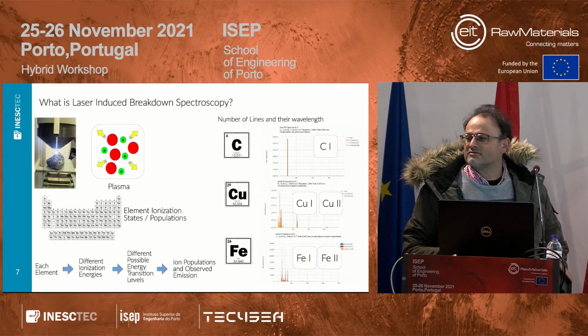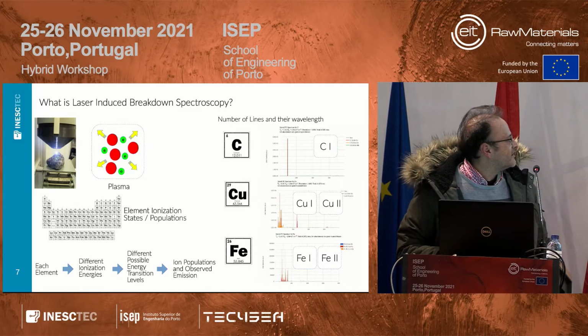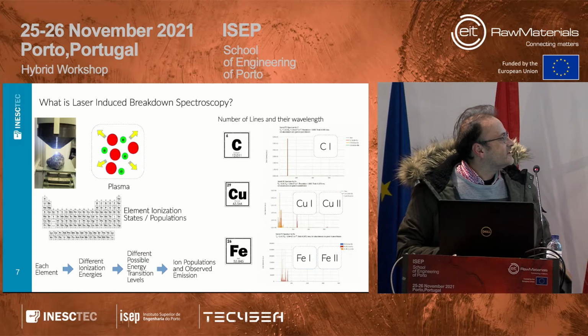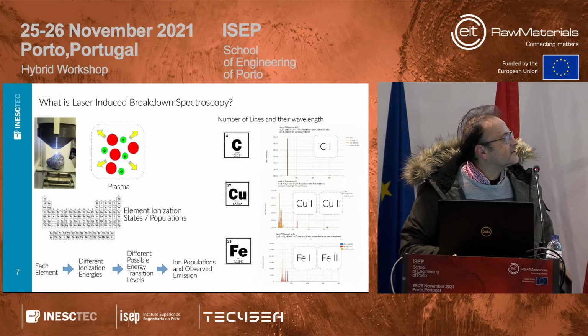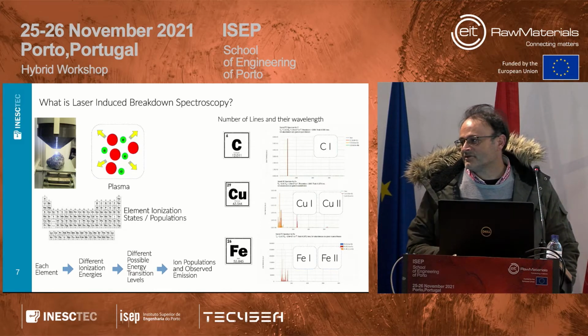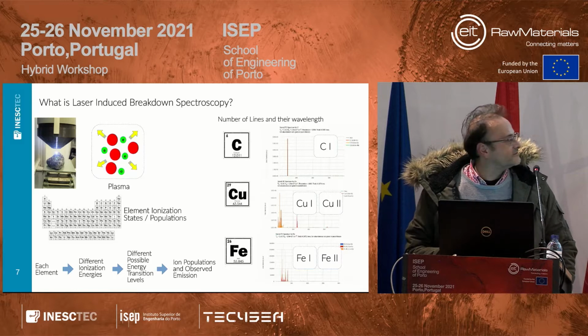So this increases the complexity, as each element has different ionization energies, different possible energy transition levels, and the ion populations and observed emission are very temperature sensitive.